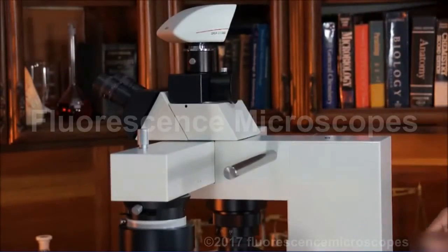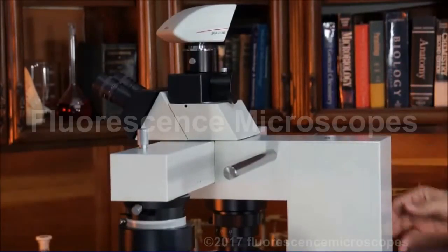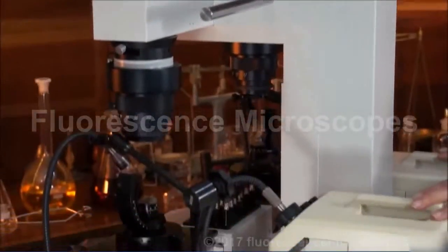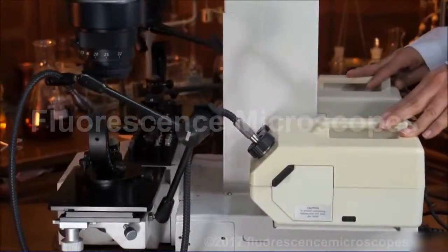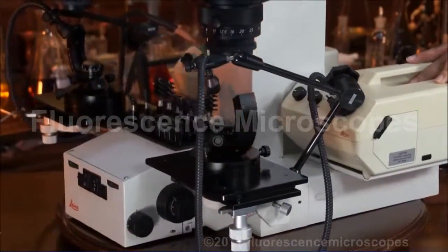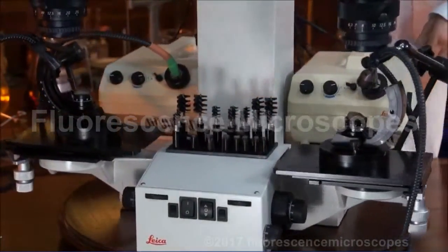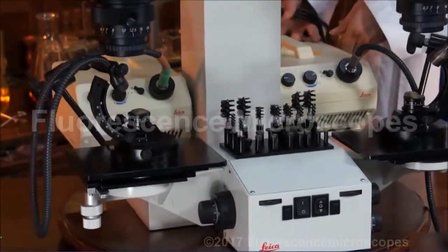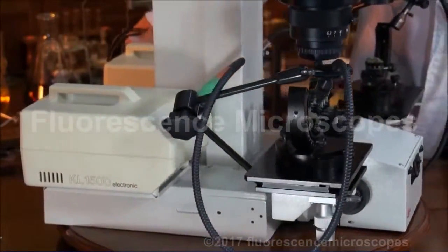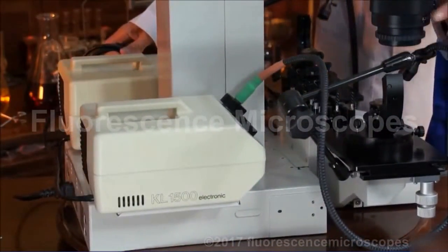This frame is volt selectable, so you can go to 110, 120, or 220, 240 voltage. These particular fiber optic illuminators are 110 volt only, but those are very easily changed to 220 volt. This microscope was a very expensive one whenever it was first sold — it's got a lot of features and the optics are superb. The most important thing would be the zoom optics.